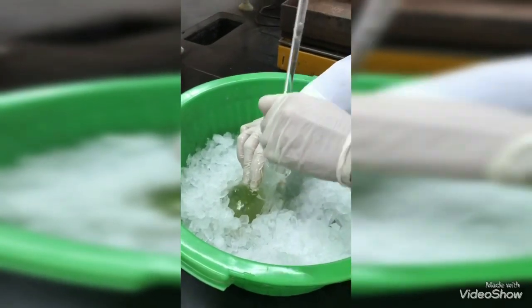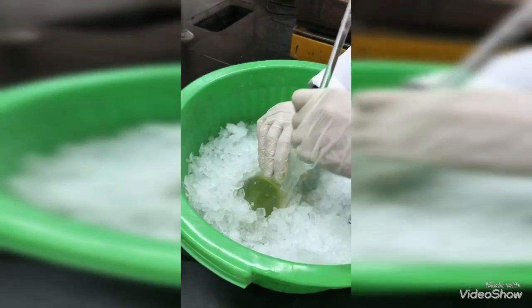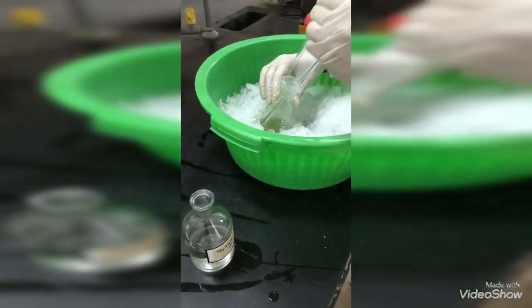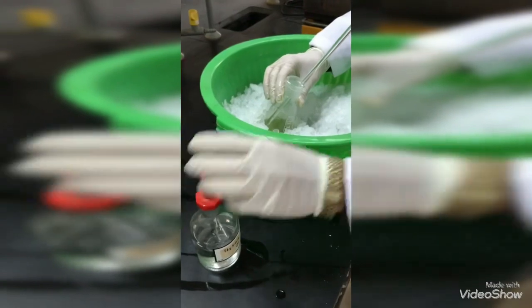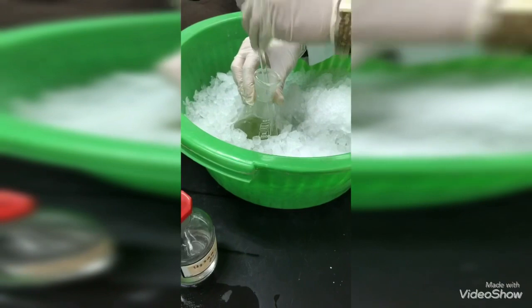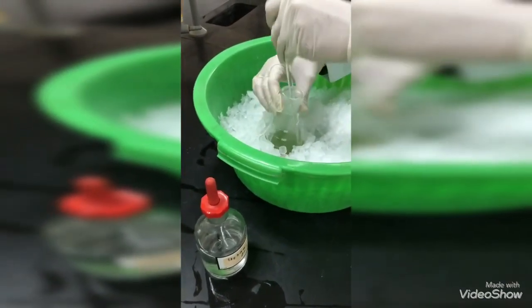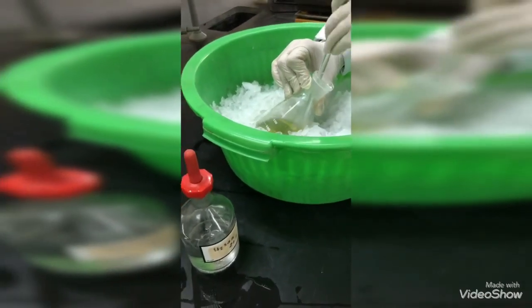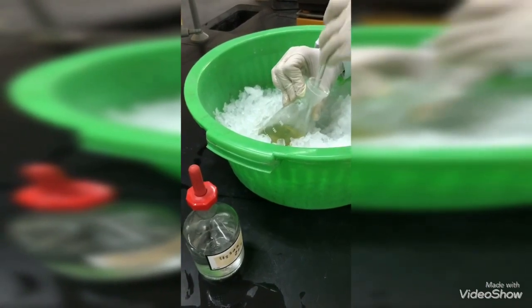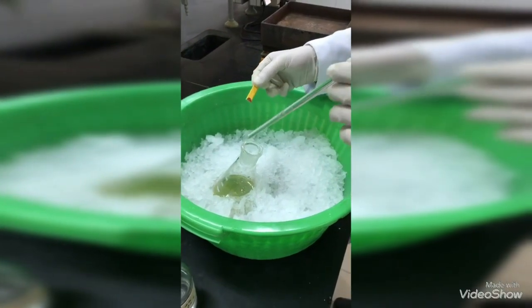Start stirring using a glass rod in order to get your product. Check pH using litmus paper. Okay.